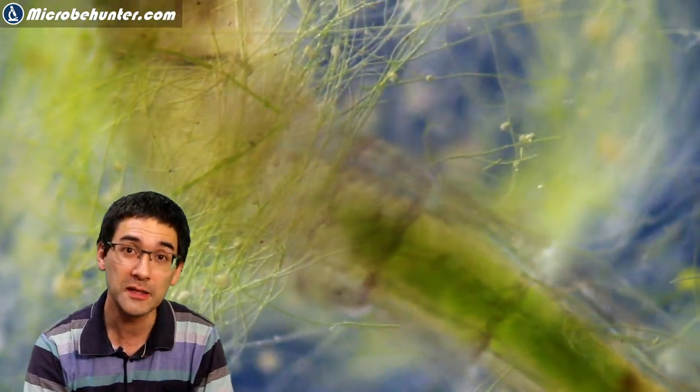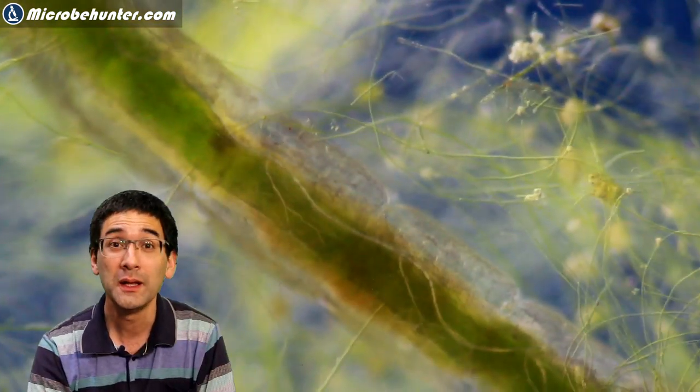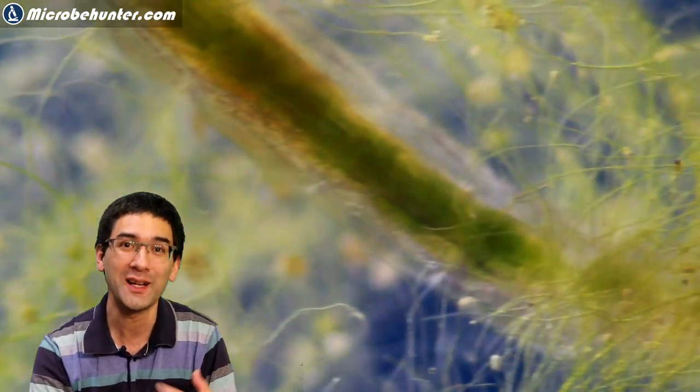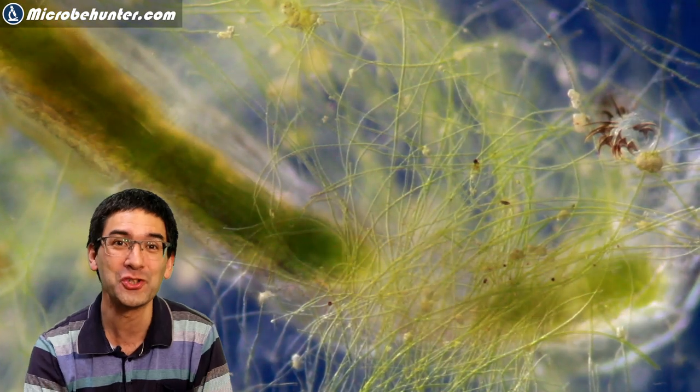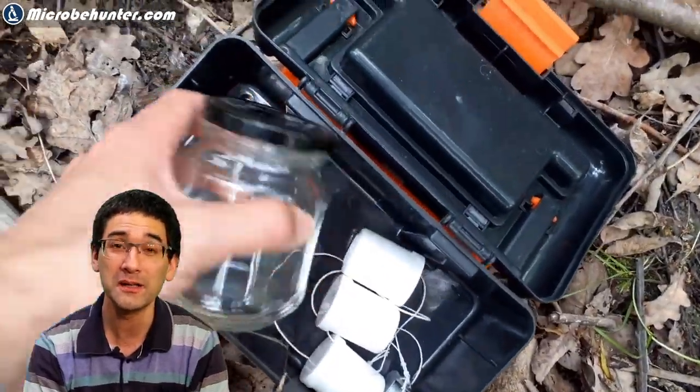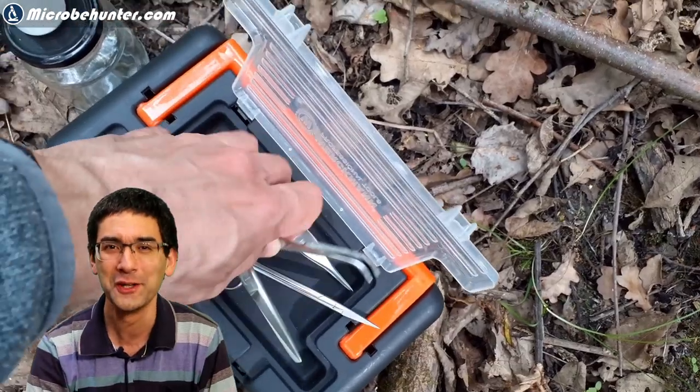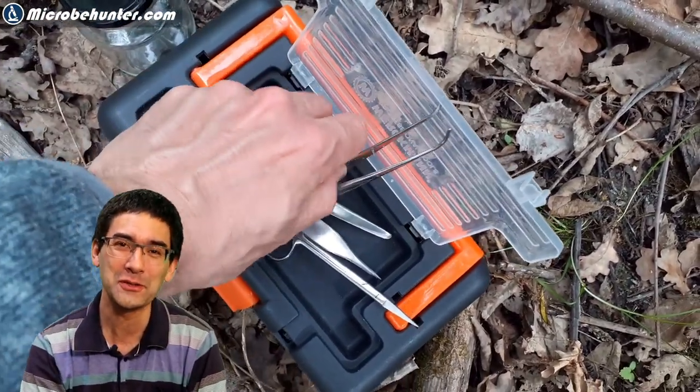When you make an enrichment culture at home by adding fertilizer to pond water, the biodiversity is not quite as high. But natural sources are generally pretty good and quite interesting because you find all sorts of things. I put down my little field box—actually a toolbox that I've converted into a field box.